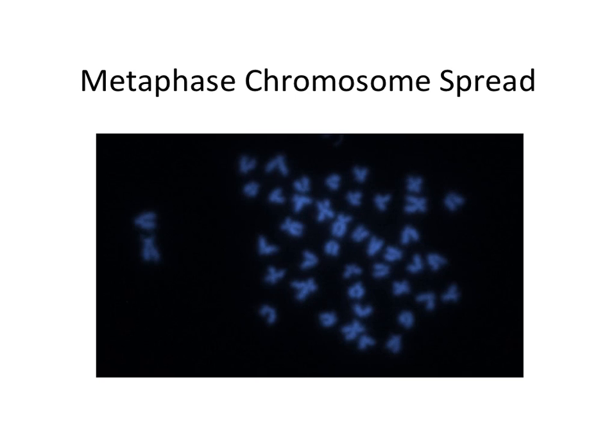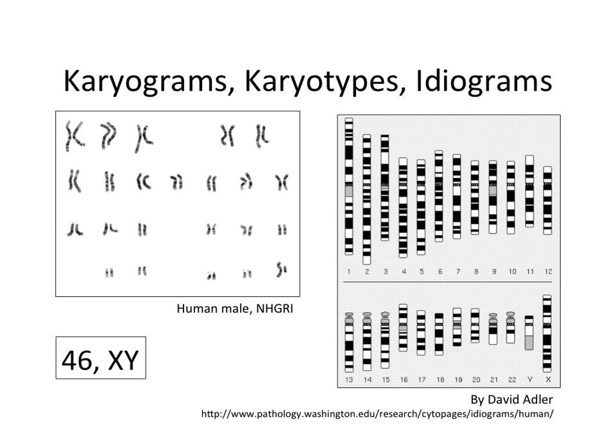They appear blue because these chromosomes have been treated with a dye called DAPI, which binds to nucleic acid and lets us see where the chromosomes are. One of the things that cytogeneticists, who are geneticists that study chromosomes, can do with a metaphase chromosome spread is build a karyogram.